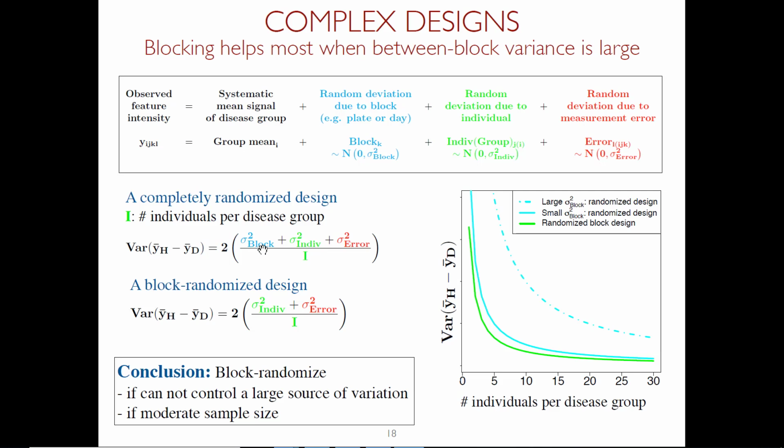So what I will do, again, when designing this experiment, I have a pilot study where I will just try to understand how much day-to-day variation I have. If you think that your day-to-day variation is only mass spec, then QC samples can be just fine. But if you think that the day-to-day variation incorporates digestion and other types of things, then you probably want to work with the actual samples, right, as opposed to just a subset. So it depends a little bit, right?